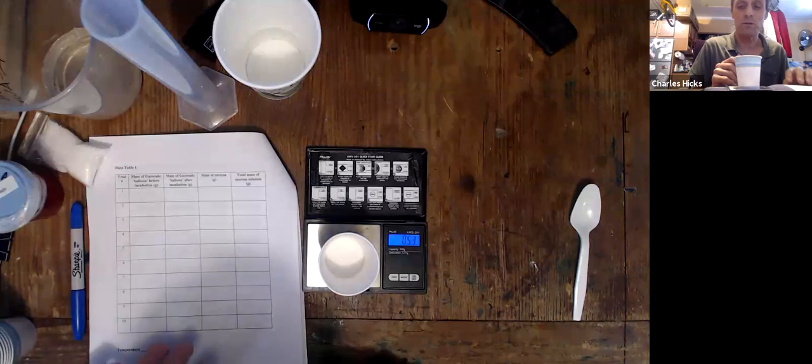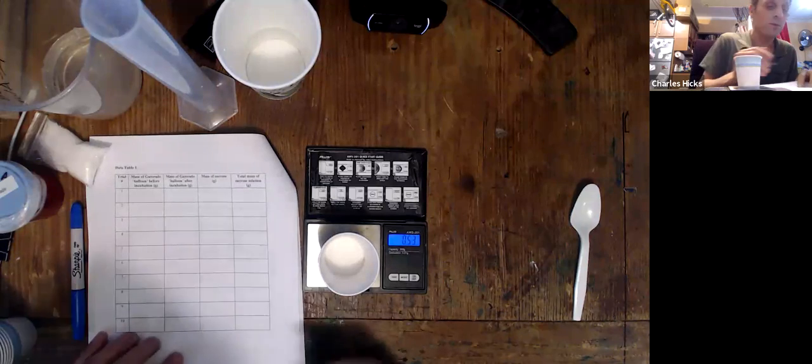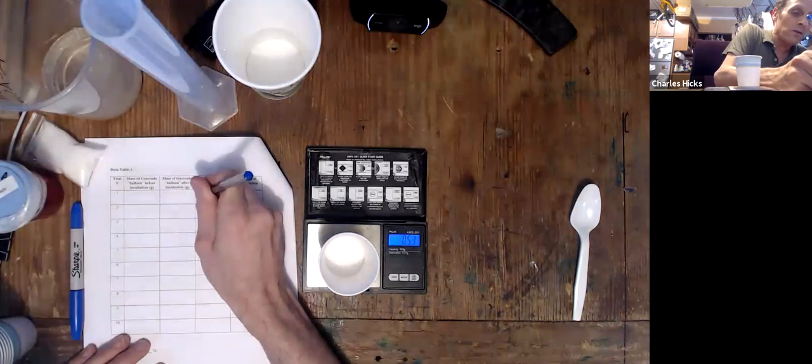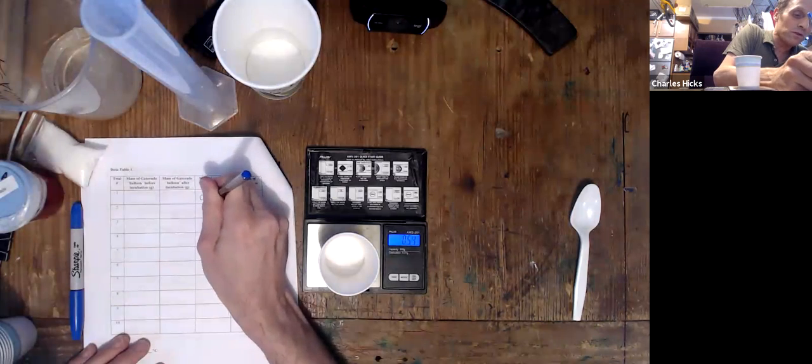So before I do anything else, I'll make sure I record that value. 0.53 now is what it reads, and that would be the mass of sucrose, and I'm doing trial one.